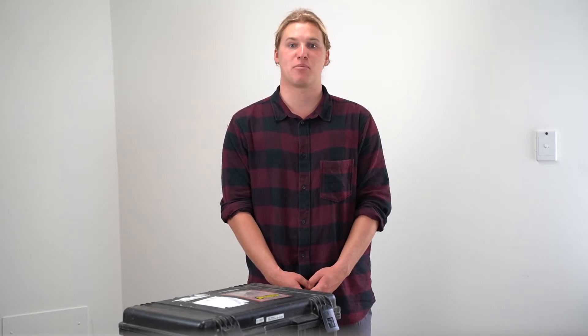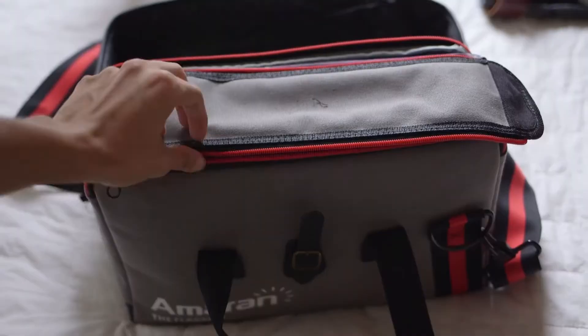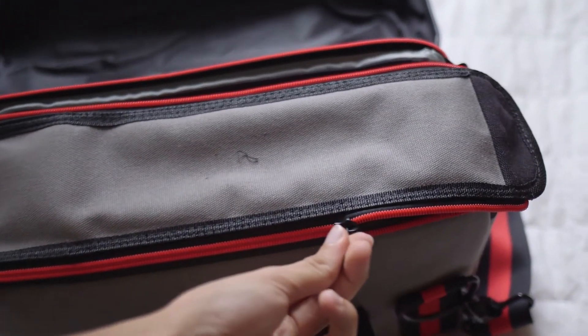One other thing to consider when packing up your XRF: if you're flying domestically within Australia, be sure to take the lithium battery out of the case and put it in your carry-on as required.